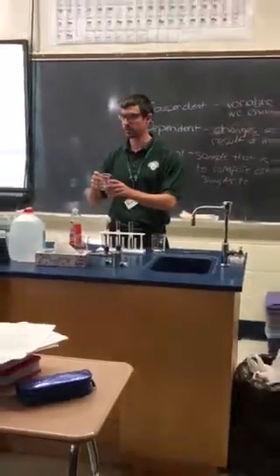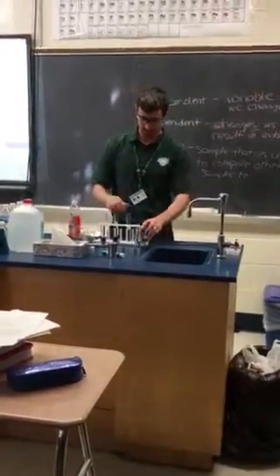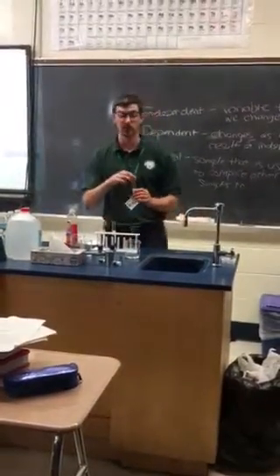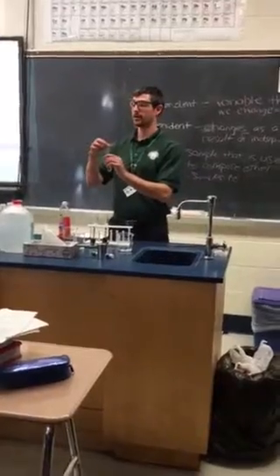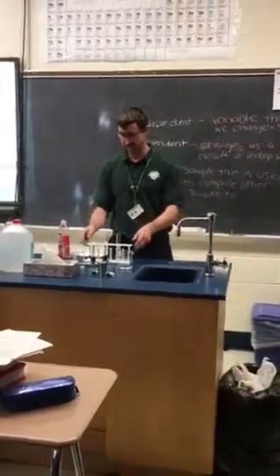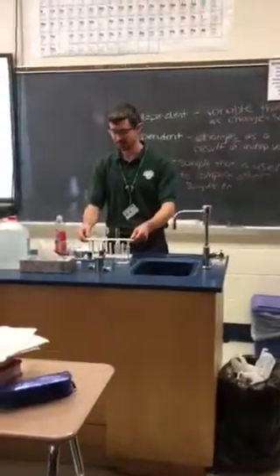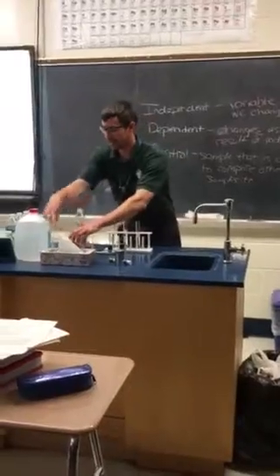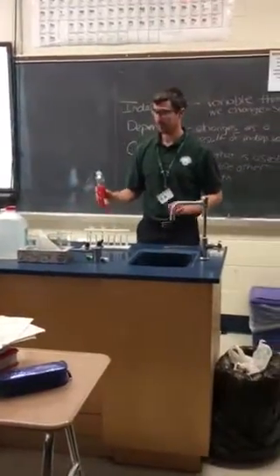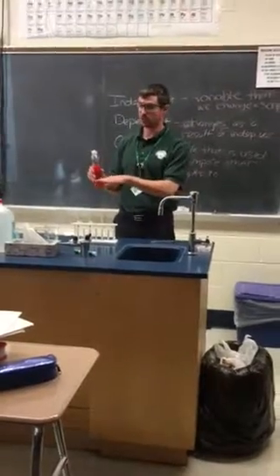Just real quick, let's define these items. This is a beaker. I think this is our first time using a test tube. It's a test tube. And this is a test tube rack. Okay, so now we're adding 2 to 3 drops of soap in each test tube.